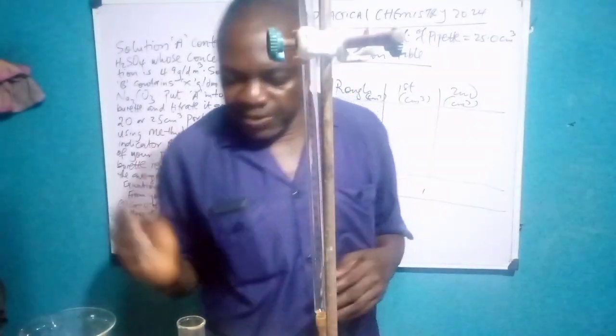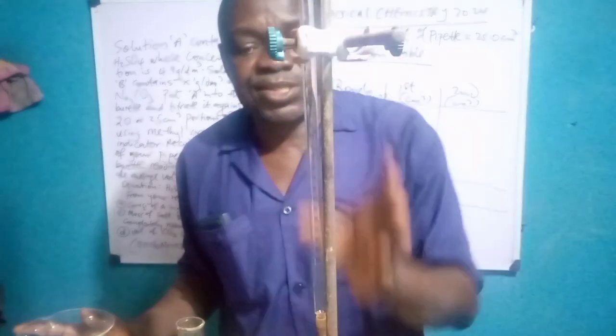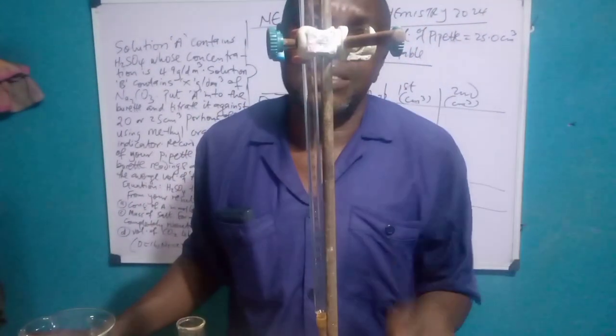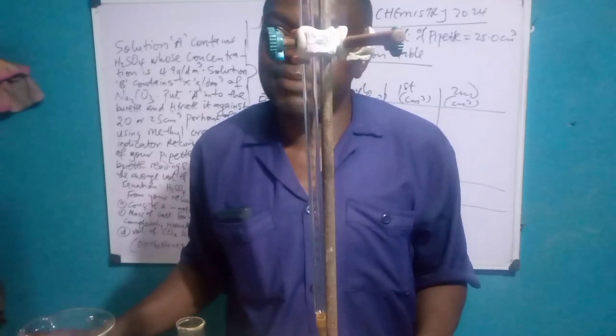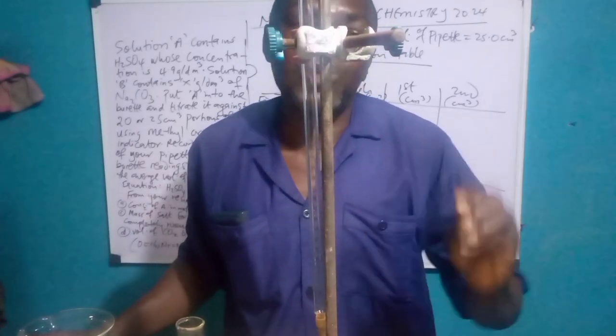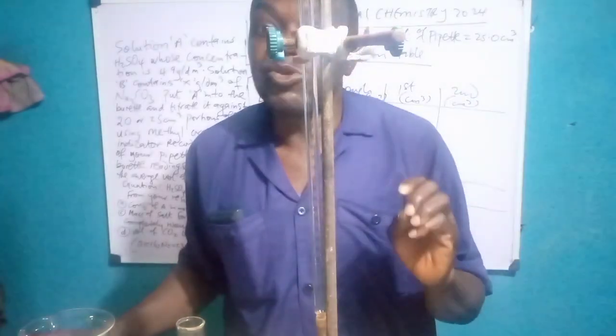So let's do the titration. Remember, you have to rinse this. Follow my first titration, I've already rinsed it. Go and search how to carry out a perfect titration and draw a perfect titration table. All the precautions are there. Ensure you study that video very, very well.